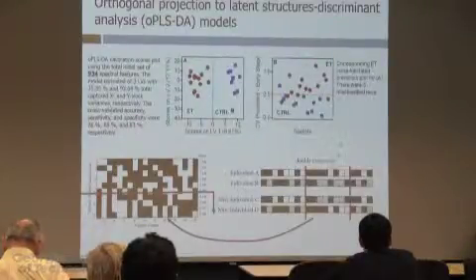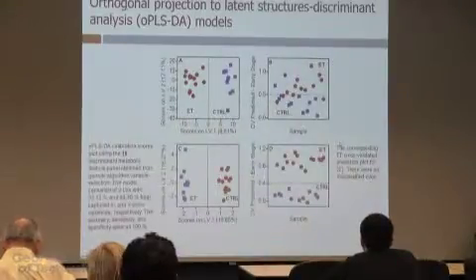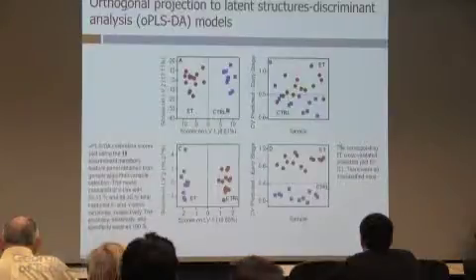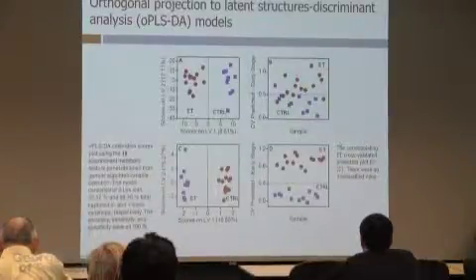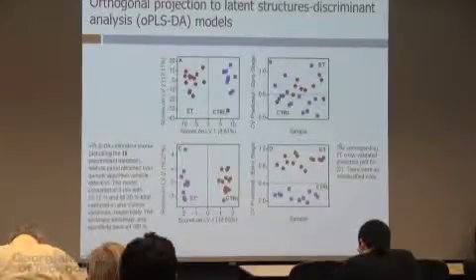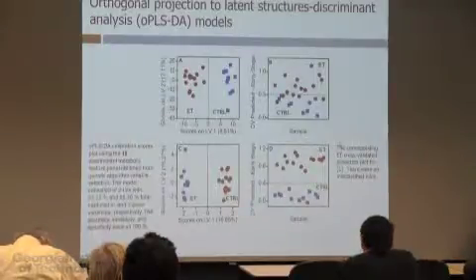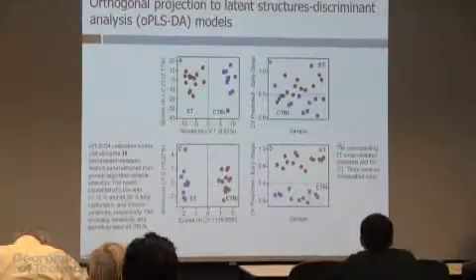So we did that with our mouse data. And we came up with a new set. So this here is the new set. We went from 934 features to an optimized set of 18 features. In this case, we can probably safely start calling them metabolites that actually separated well not only in the training stage, but also separated, in this case, exactly separated in the test phase.